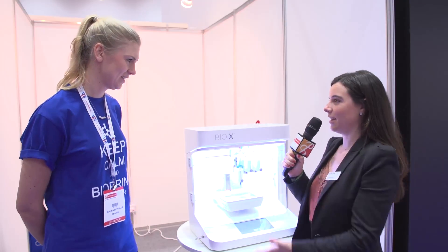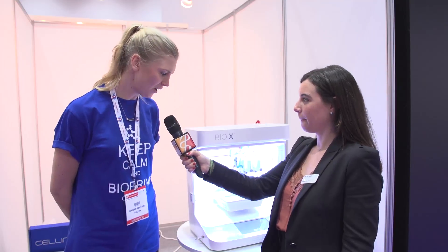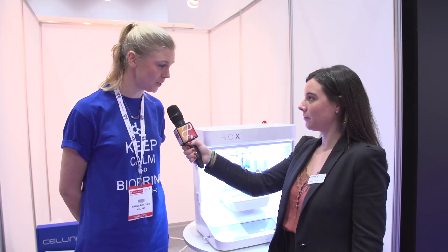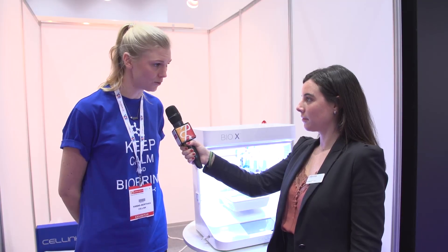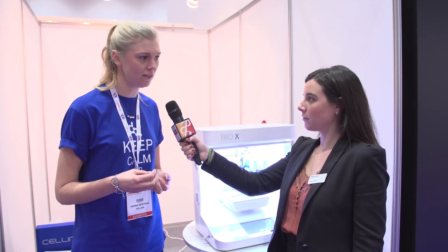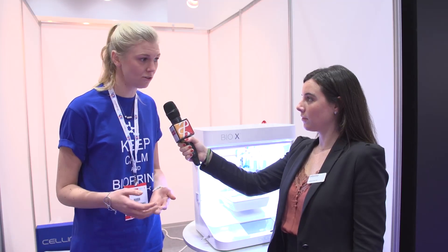So can you tell us what BioX does? Yes, it's a 3D bio printer, which means you can print 3D structures with living cells — you can print skin tissue or heart tissue or even cancer tumours for cancer research.